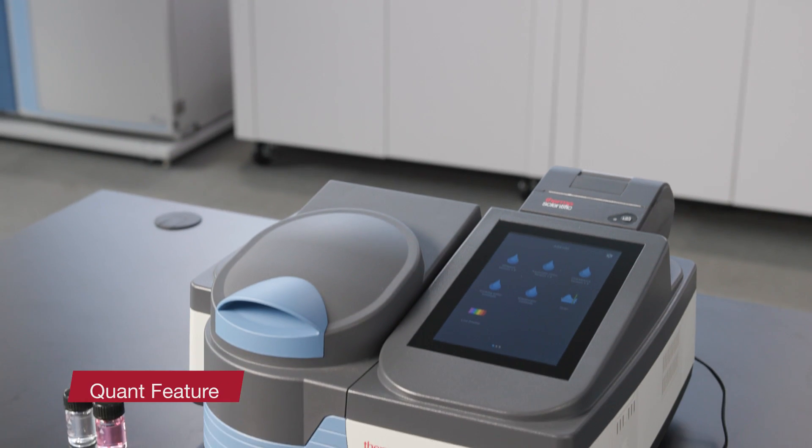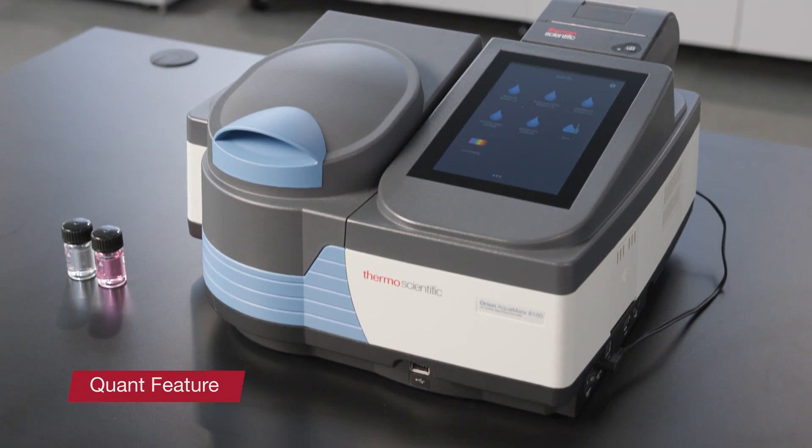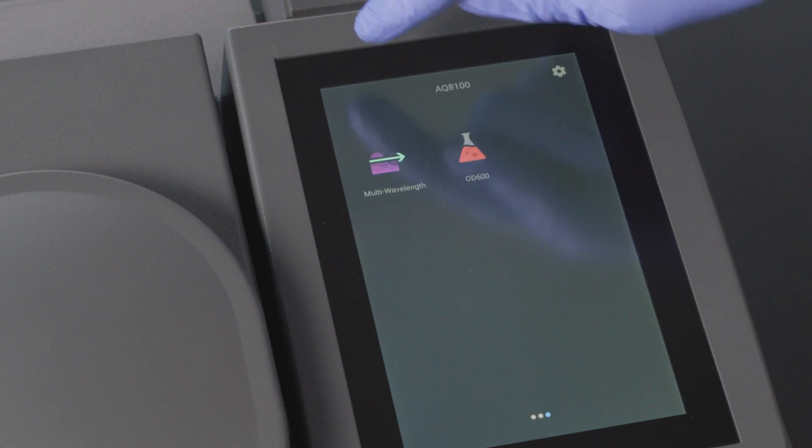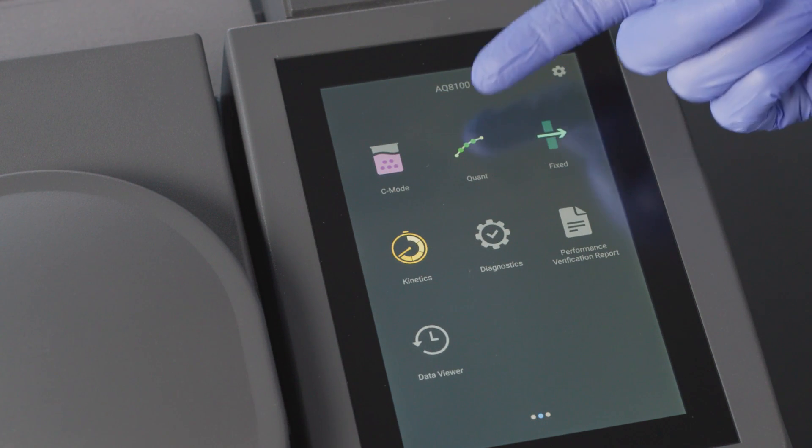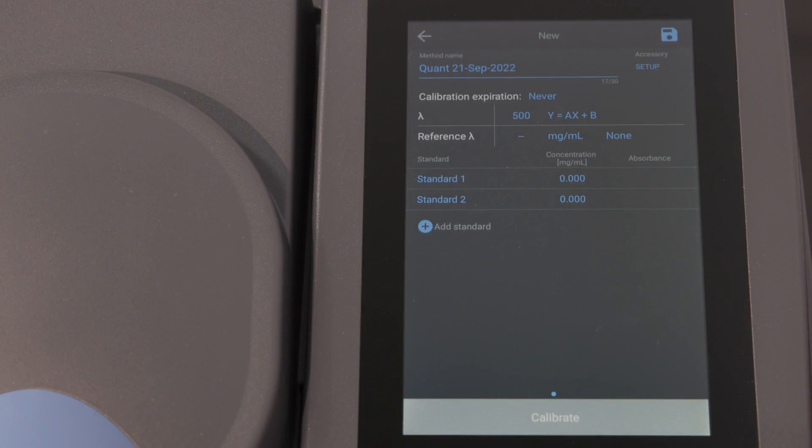Another item that I should point out is the Quant feature. This allows the user to create custom methods and standard curves in a more traditional approach to spectrophotometry that is sometimes required in regulated or academic settings.